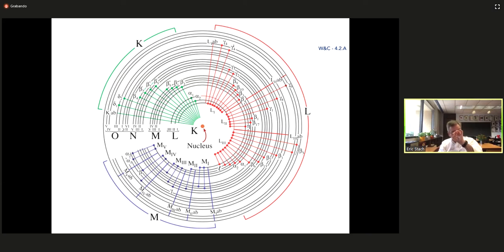So in the inelastic K edge, that's because you've got a K edge leaving from the core and coming all the way out into the conduction band. But if you have the L3 edge, it's leaving from L3 and going all the way out into the conduction band. So that's the difference between the different states. And so, Anicia, if you could give me a thumbs up to let me know that that answered the question, or repeat the question, that would be great.